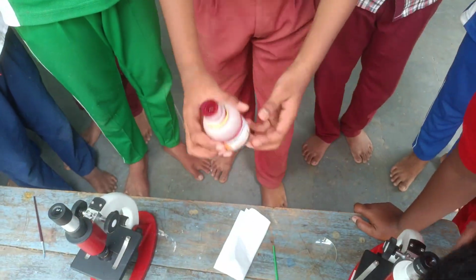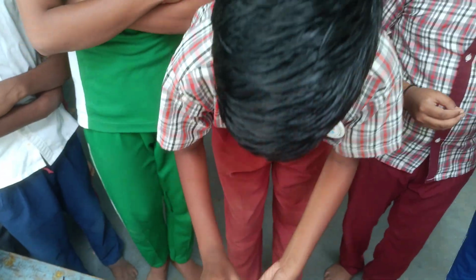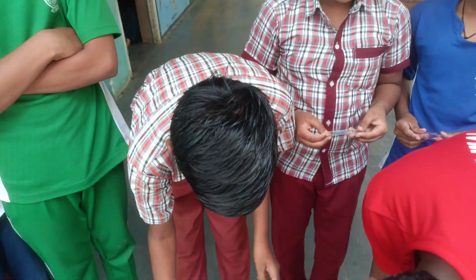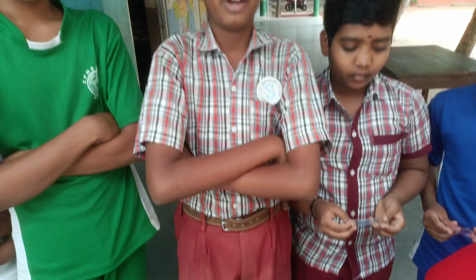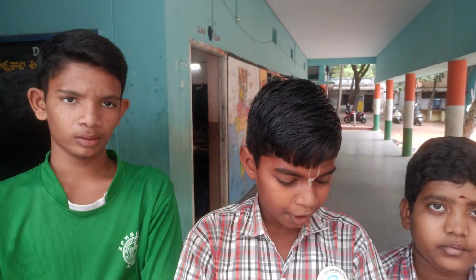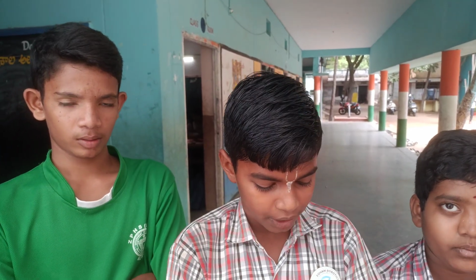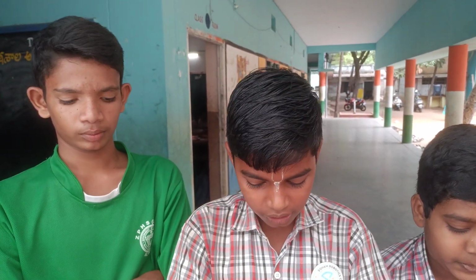Required chemicals: safranin, methylene blue, and microscope. We are observing onion cells in onion peels in a microscope. We pour safranin.